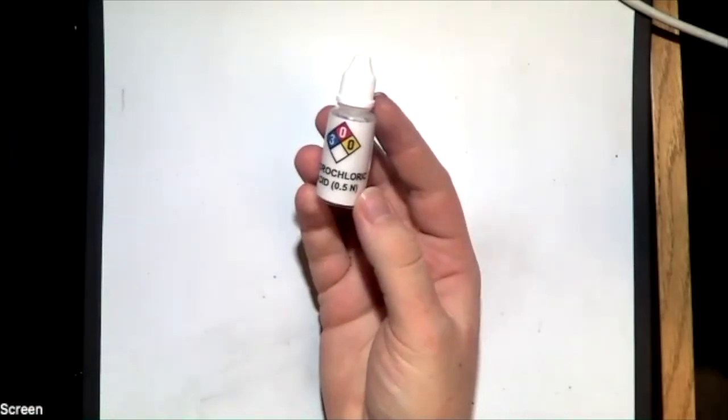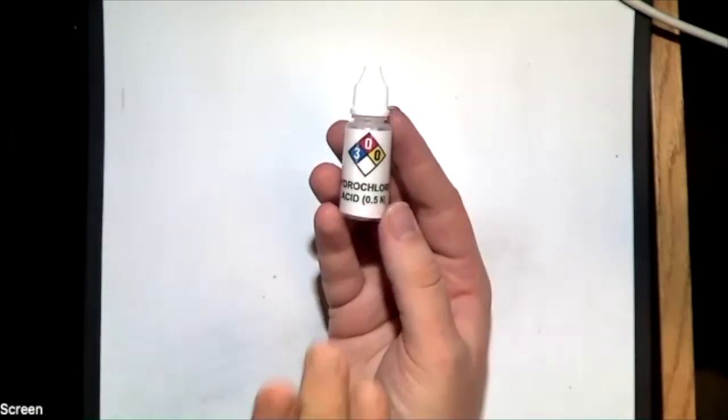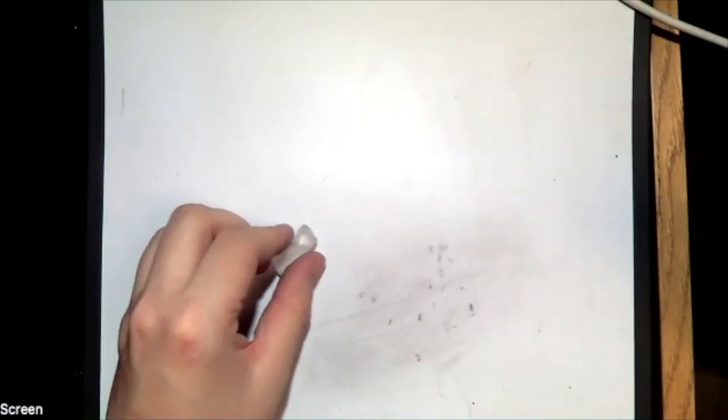So let's go ahead and start with one of the most common ones, which is going to be hydrochloric acid. Hydrochloric acid is not going to be something you should fear in this course, but you should keep an eye out for it. So some minerals, specifically carbonate minerals like calcite here, will actually react with acid. And I'm going to zoom in quite a bit on this.